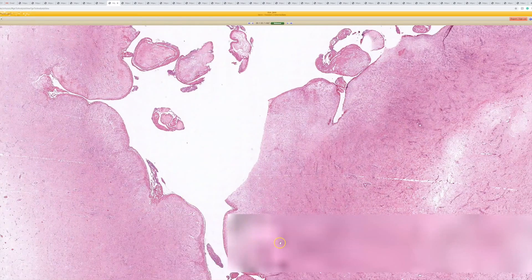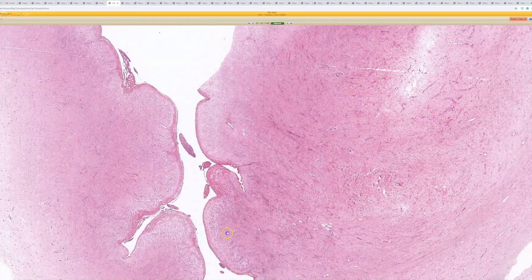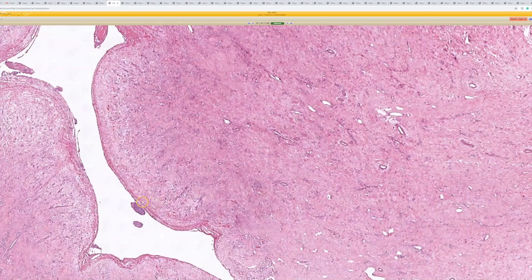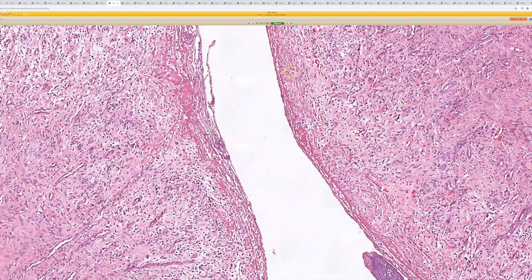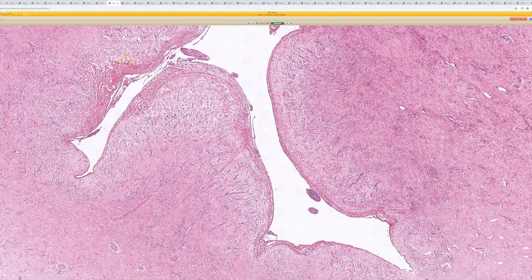Great, that's a good differential. So this is a very robust example of reactive change in a ganglion cyst in this case. And again there's no lining here, right, it's just granulation tissue and then all of a sudden you got some fibrin and empty space. Good job.